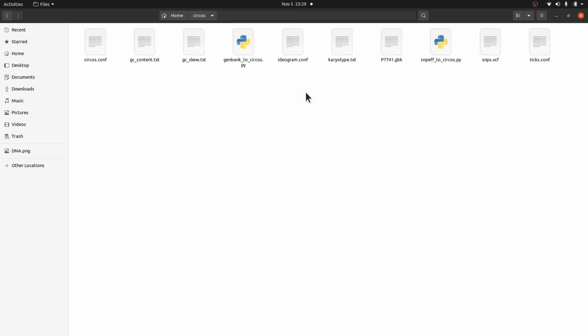Now we need to add the variant information. Okay. So we will use this. But first we have to extract the information using BCFtools from the SNPs, and we process that file to get our final output. So I'll do this.